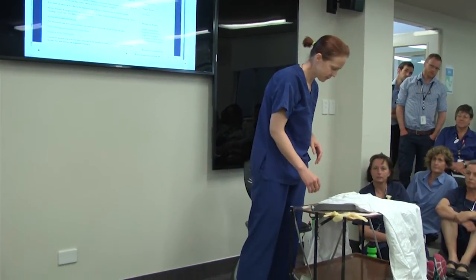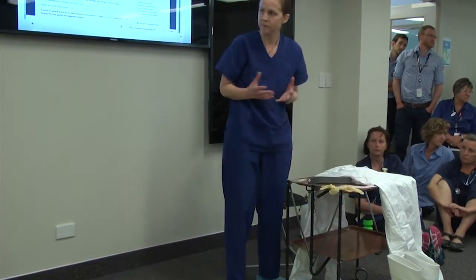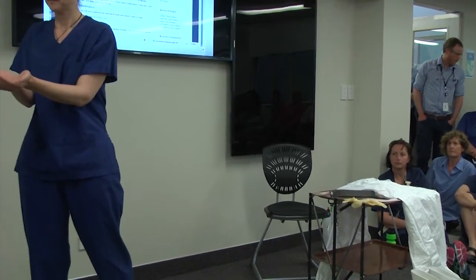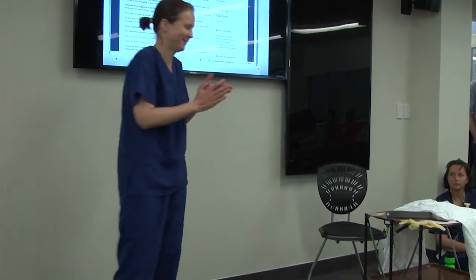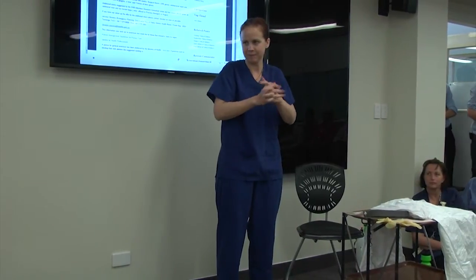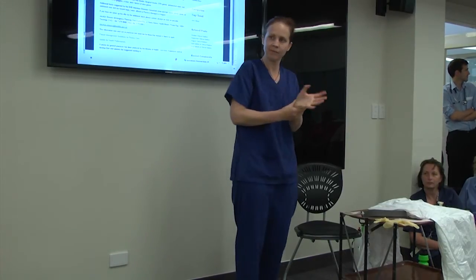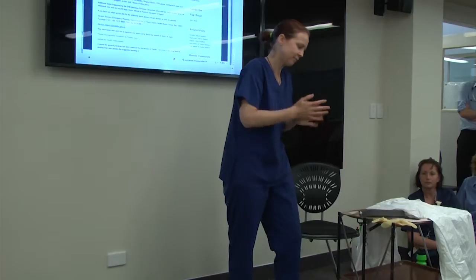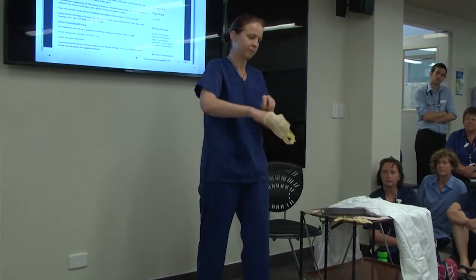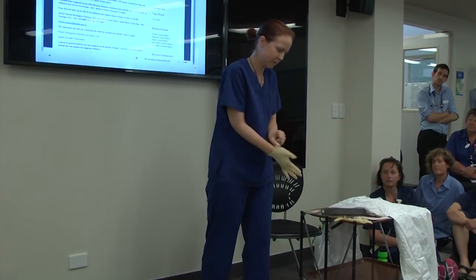The next step — the first thing we always do is hand hygiene. Then you put on your first gloves. This is not a sterile procedure, so we're not using surgical technique; we're just putting stuff on.